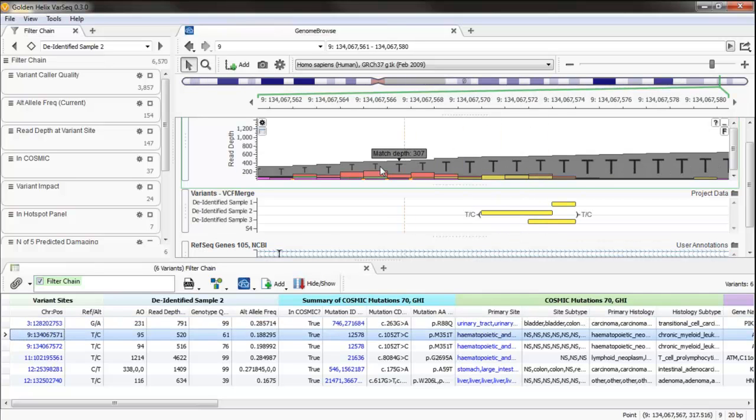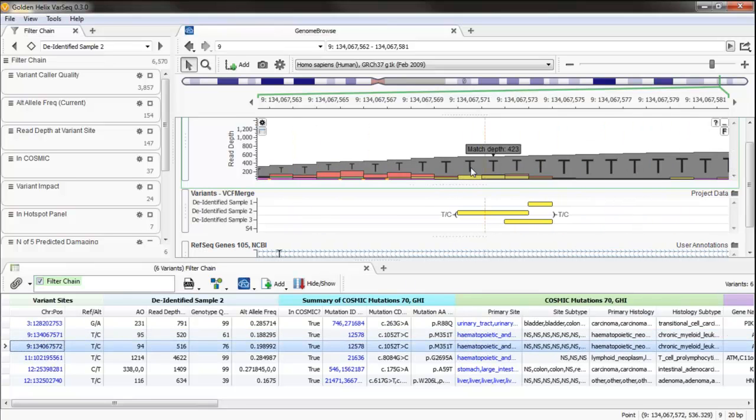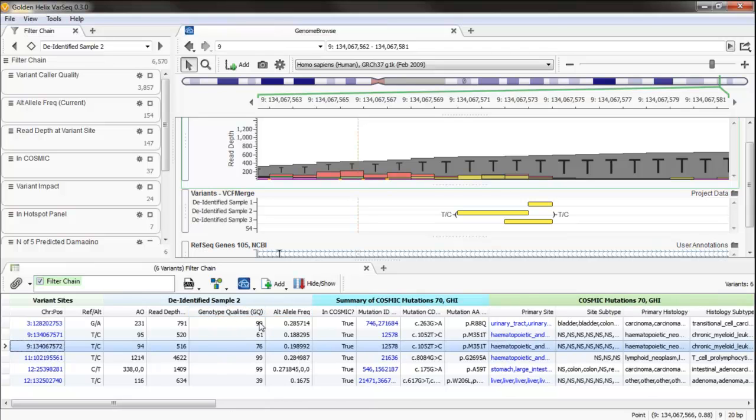This one doesn't look quite right. We're in a big string of homopolymers, and these two variants right beside each other certainly look like one of these issues where the homopolymers are getting confused, and so we have mutations that we're trying to detect because we're trying to do sensitive somatic detection. But you can see their genotype quality scores here are not as high as these other ones that we are looking at. So this might be motivation to adjust a parameter like that in our filtering process.